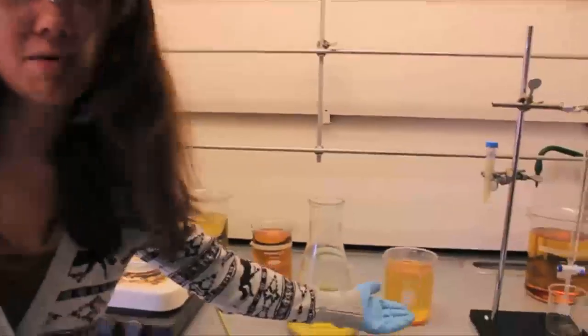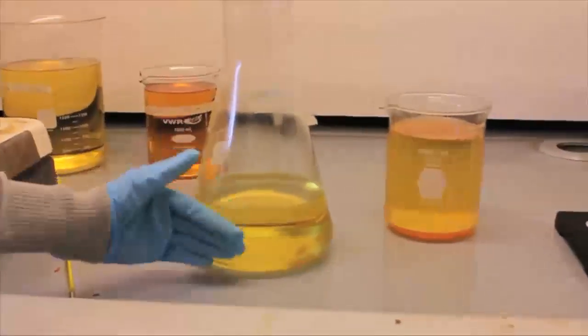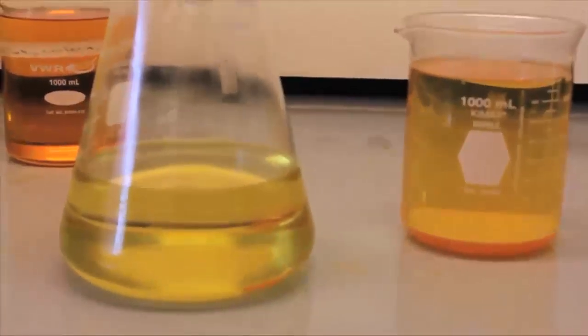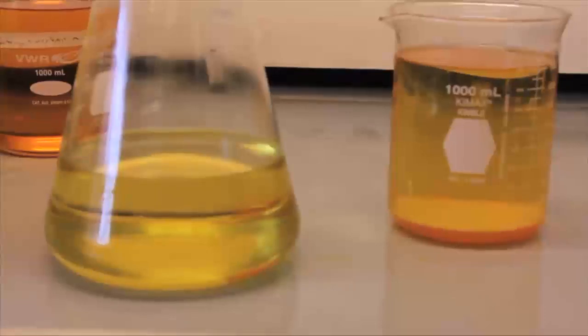So here we are with our intermediate and final products. This is what came off of the reactor before we filtered it. And this is the final product, which is used in buses around campus. This is a cleaner burning fuel with less emissions than that of regular diesel.